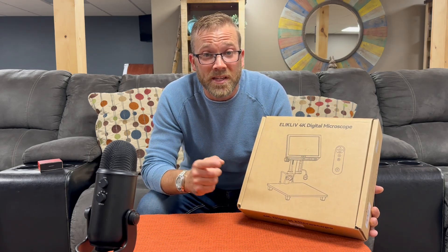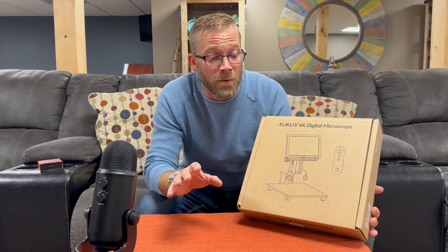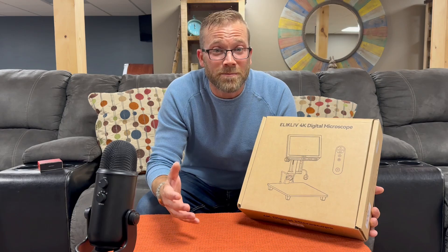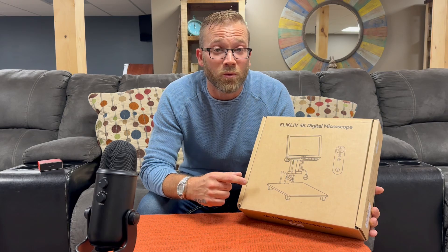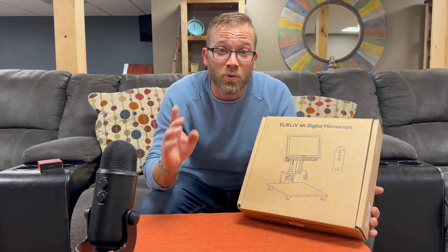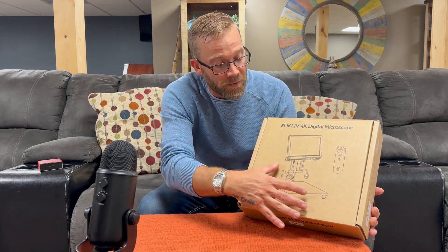I want to thank Blue Sky C for sending this to me. I've never owned one so this is gonna be brand new for me, but I want to go through it as thoroughly as I possibly can. This might not fit the overall aspects of the channel but to me it does, because this is going to be very useful if it works the way it should. We're gonna find all that out in this video, and if it's not up to par, we're gonna let you guys know.